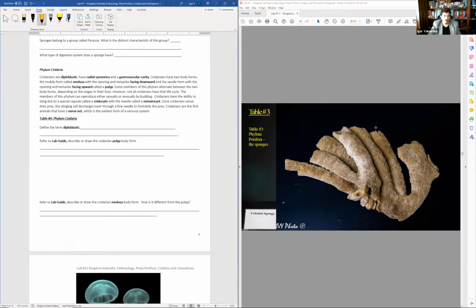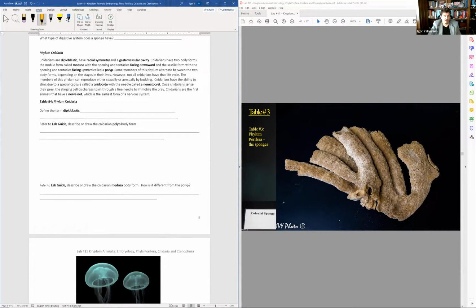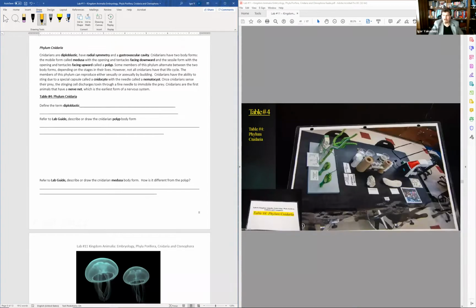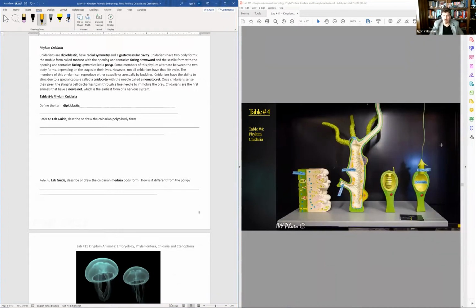All right, now next group, Cnidarians. Make sure you understand what that particular picture shows, because most likely it will be on the lab practical. We're looking at the hydra overall, that's a polyp body. We're looking at the tentacles. We're looking at the gastrovascular cavity.